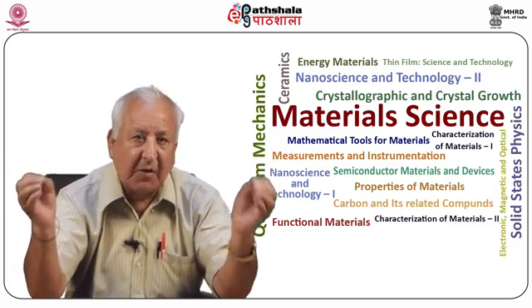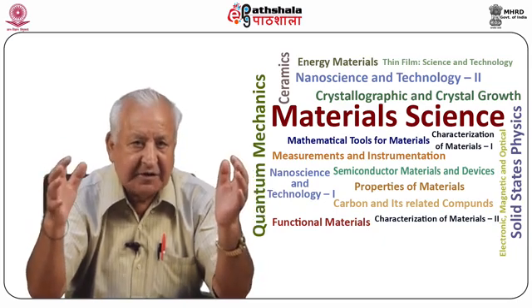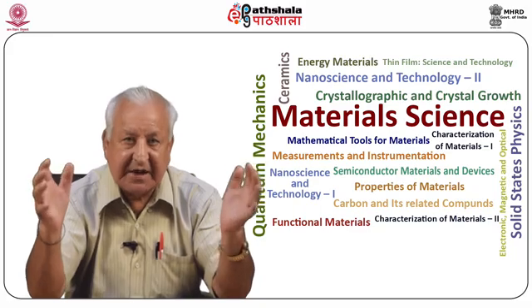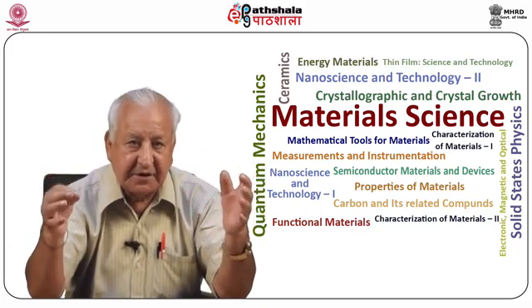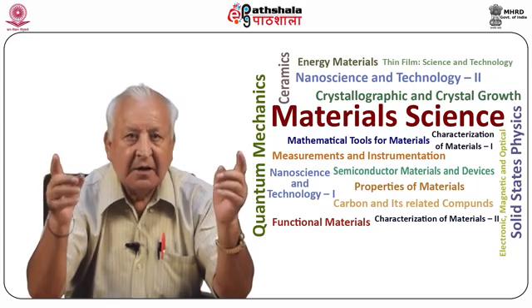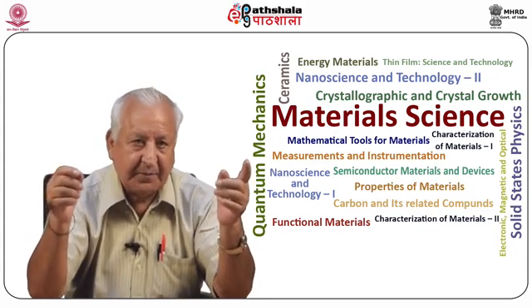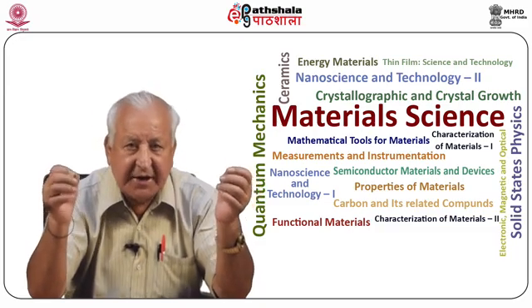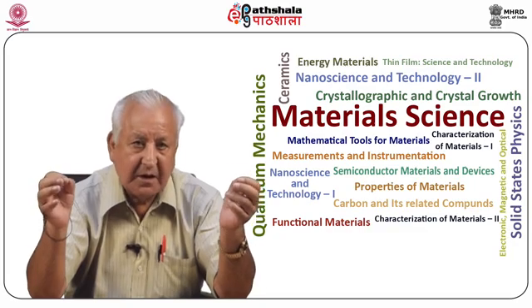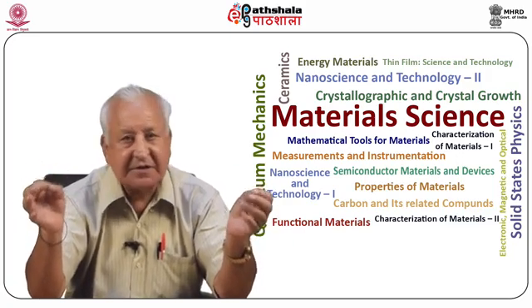X-rays have proved to be of great importance on account of the fact that they have many and varied practical applications, which may be summarily classified as follows. Purely scientific application, such as in crystallography, to analyze and determine the internal structure of crystals and investigate the perfection of crystals. Industrial application, which is also given a general name of radiometallography. Medical application, such as radiodiagnosis, known as radiography, and treatment, that is X-ray therapy. Here we will take up only scientific application relevant to crystallography for analysis of crystal structure.